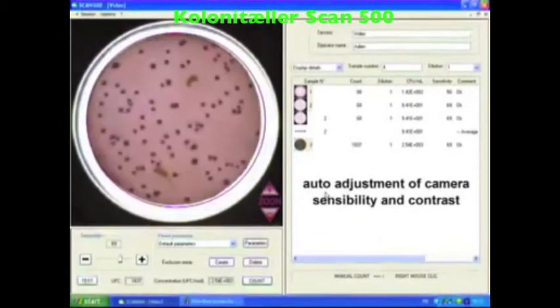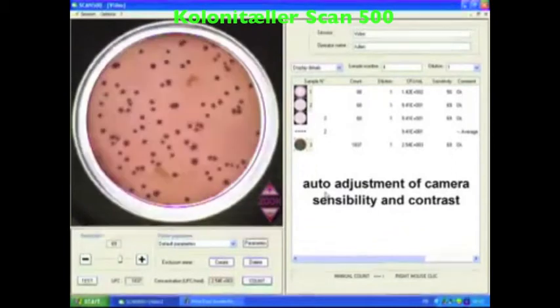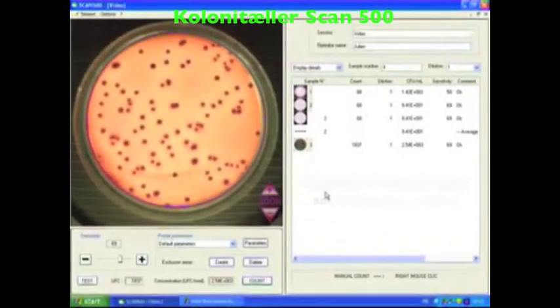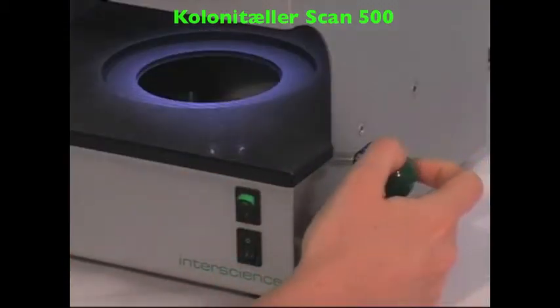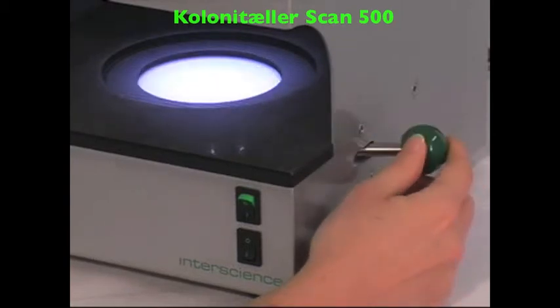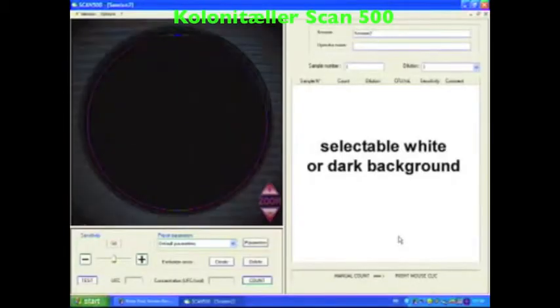Sensitivity and contrast are automatically settled by the software. Depending on the consistency of your agar, choose between the light or dark background.